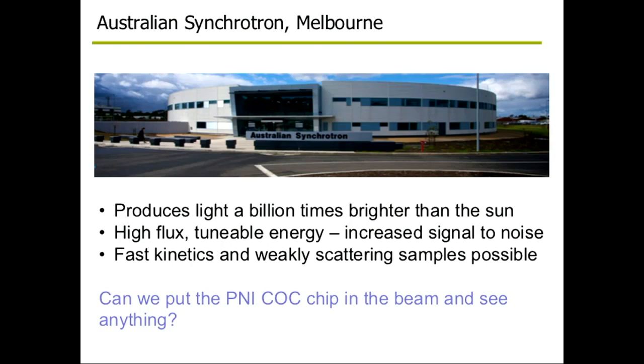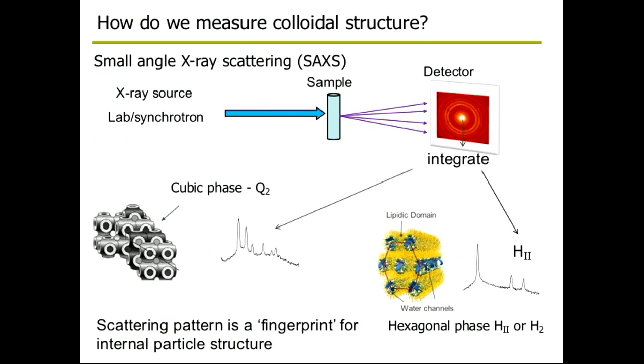So how do we then do that with a microfluidics system? On the previous slide I had that we can have a lab X-ray source where the source of the X-rays is really weak, and to get the sort of diffraction that we see here in a really clean glass capillary, you probably would never get that quality diffraction actually. You'd be acquiring forever and never get the signal to noise. And so that might represent at least an hour or more of acquisition time.